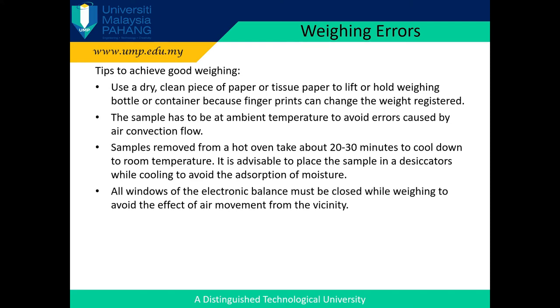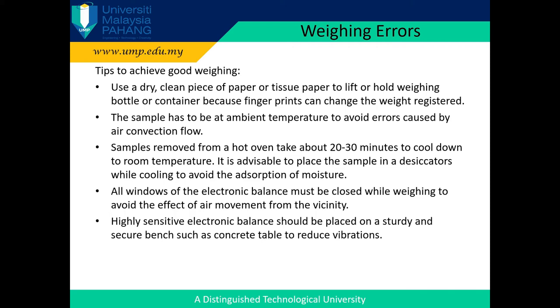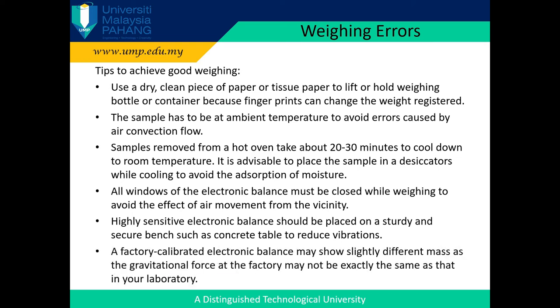All windows of the electronic balance must be closed while weighing to avoid the effect of air movement from the vicinity. Highly sensitive electronic balance should be placed on a sturdy and secure bench such as concrete table to reduce vibrations. A factory calibrated electronic balance may show slightly different mass as the gravitational force at the factory may not be exactly the same as that in your laboratory.